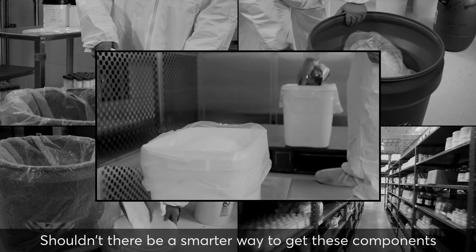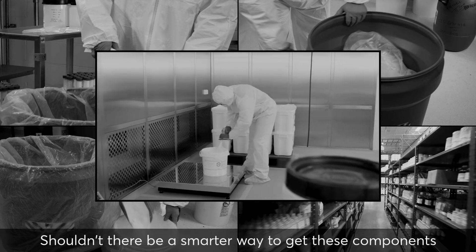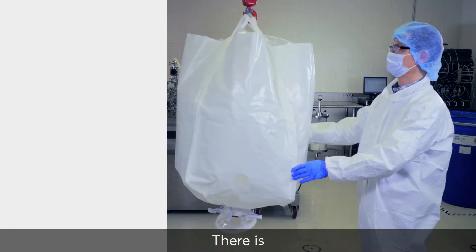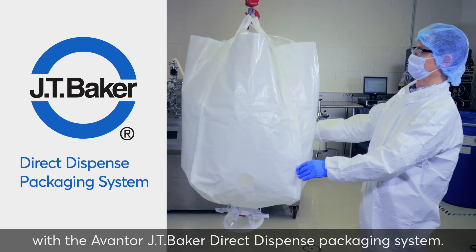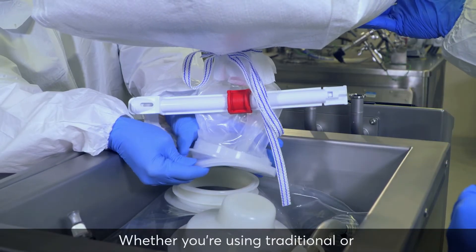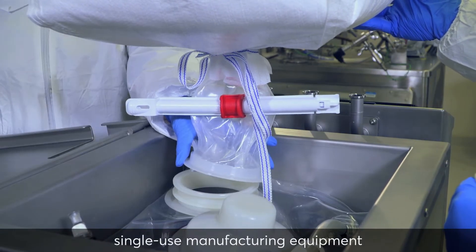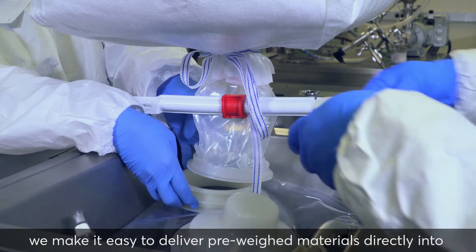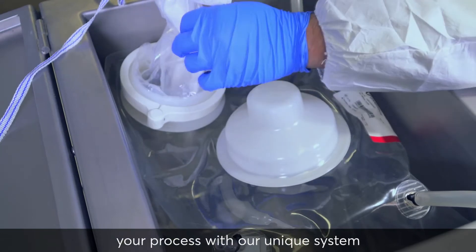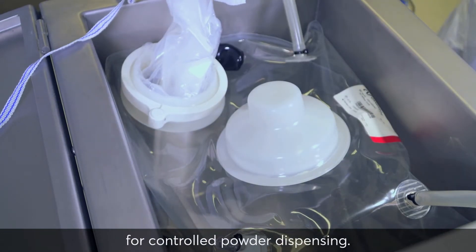Shouldn't there be a smarter way to get these components from delivery to your manufacturing equipment? There is, with the Avantor JT Baker Direct Dispense Packaging System. Whether you're using traditional or single-use manufacturing equipment, we make it easy to deliver pre-weighed materials directly into your process with our unique system for controlled powder dispensing.